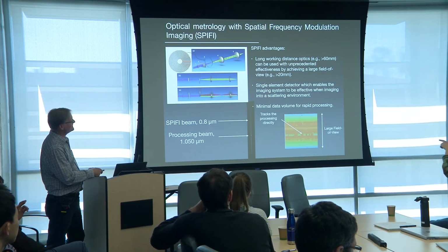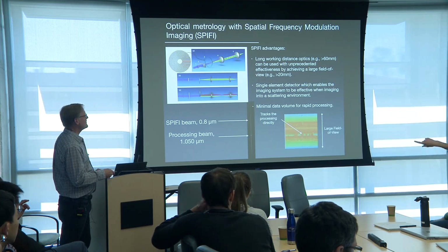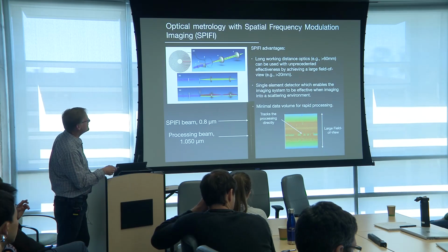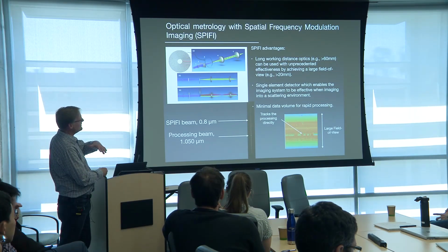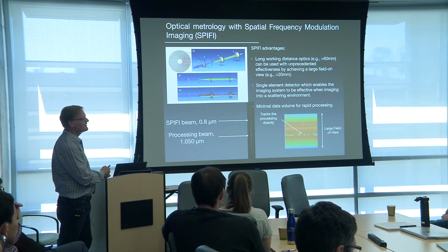But it seems like you're getting an artifact. You have that green line and orange line. Yeah, you mean you're talking about this stuff? No, up in the first quarter, right there. You see an orange line and a green line that comes across? Yeah. No, what you don't see is we've got debris everywhere on this slide. So who knows?